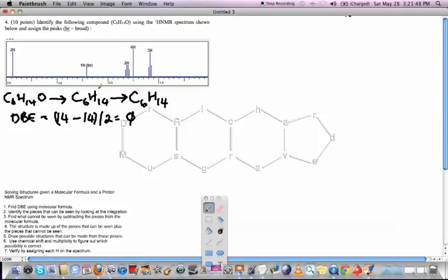Next thing we do is we figure out what we're seeing in the spectrum. And what we can see is we see a CH2. Now we also see this 1H broad over here. I want to explain what that means. So there's two situations you'll often see. You'll see a 1H broad, and that is going to be an OH or an NH.